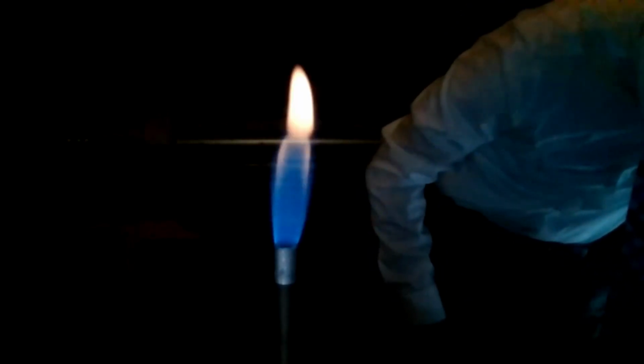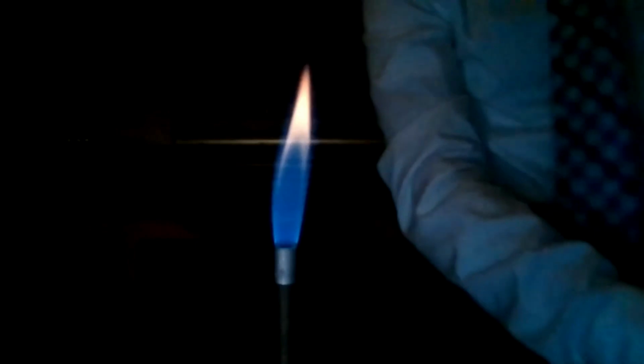Sodium. Oh, I love sodium. Sodium's a main ingredient in salt, and I love salt. Let's see, where's the sodium at? Sodium. Here it is. I passed it right up.